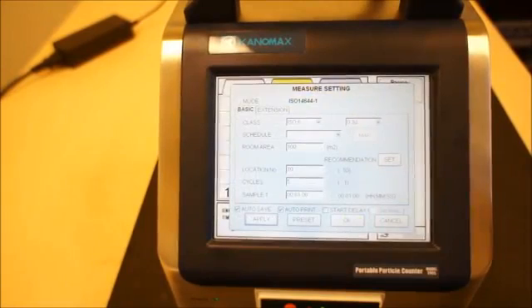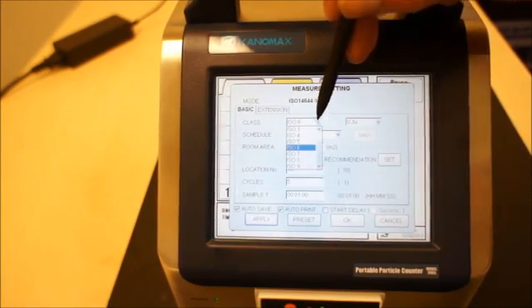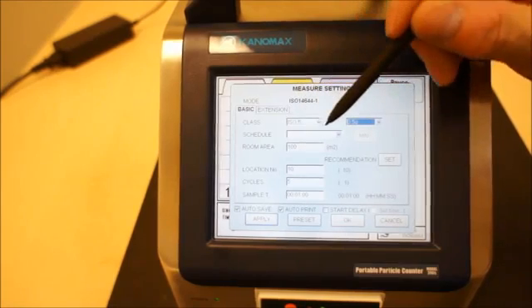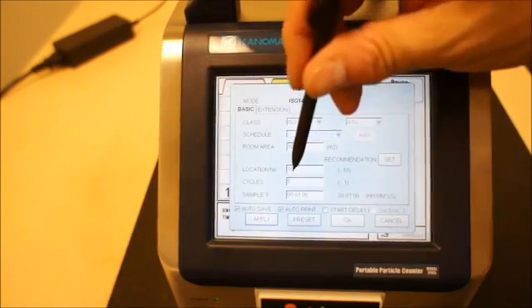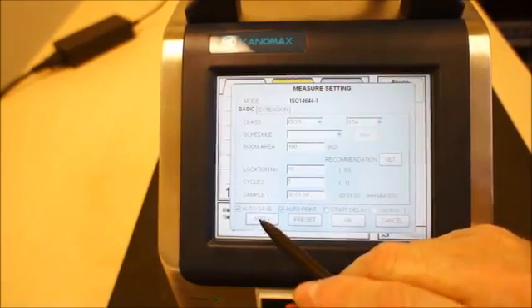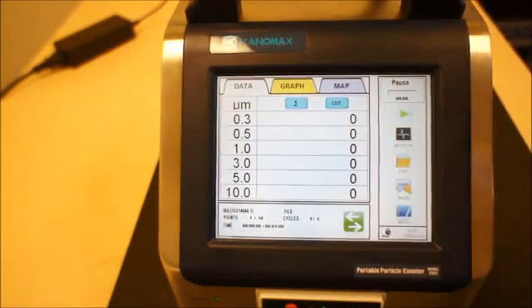You have the option to measure in ISO mode — for example, the ISO 14644-1 standard. You can enter the class of the room you want to measure in, set the individual particle size, room area size, and locations. In this mode you can set a map so that each location is notated, and when you reach each measurement location you can set the instrument to measure and store that location indicator. You also set the number of cycles and samples you want, then hit apply to store the settings. Then you're ready to do the measurement.